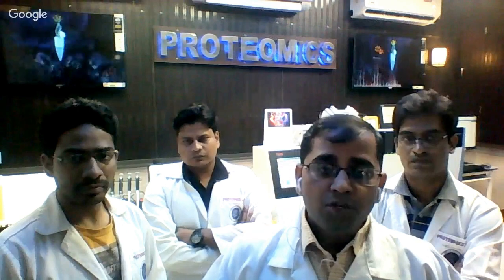So today we are standing in front of some of the very latest instruments available at IIT Bombay in my lab, one of them being the Orbitrap Fusion. Let me take you closer to that instrument and give you a little more detail about it.